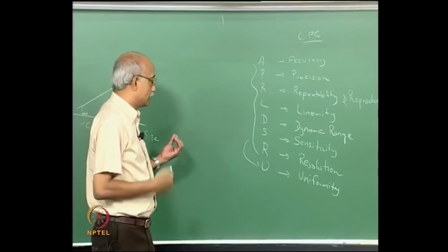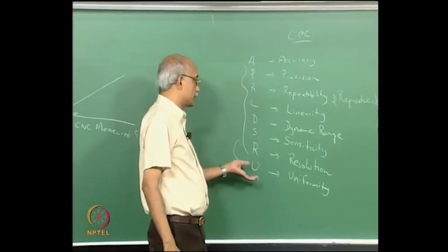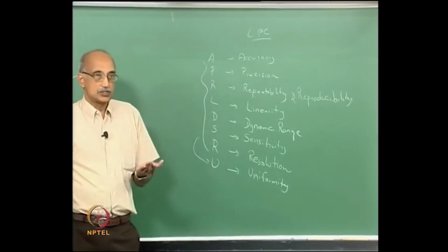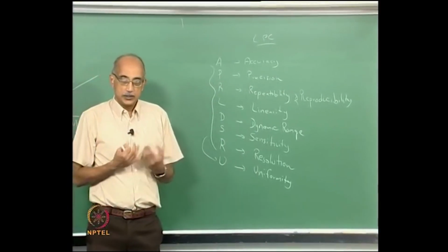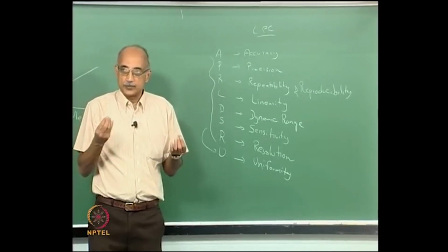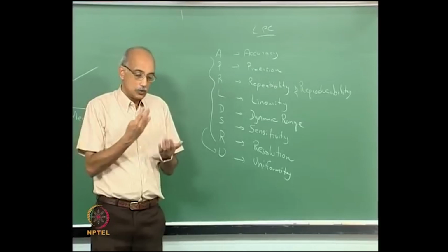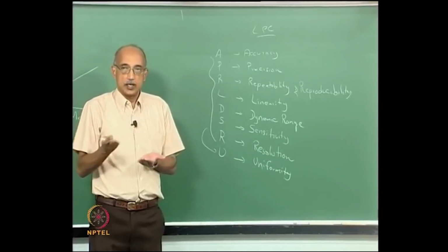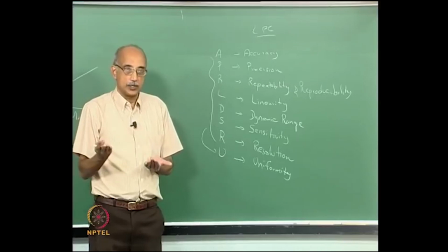So, for example, if you use a particle counter that satisfies all these criteria and you get a certain size distribution, the thing that you will always worry about is, can I rely on these data? How absolute are these numbers? If you do not have a way to reference this data to an absolute standard, you can never answer that question in a deterministic way.